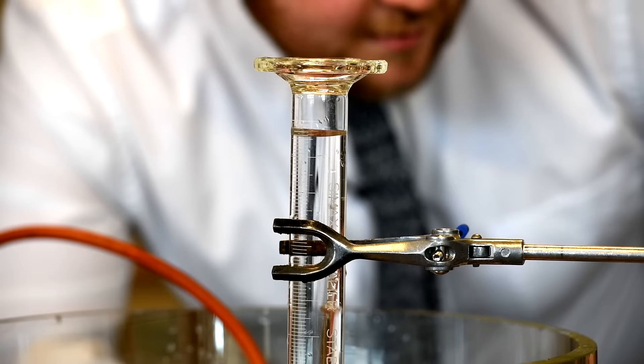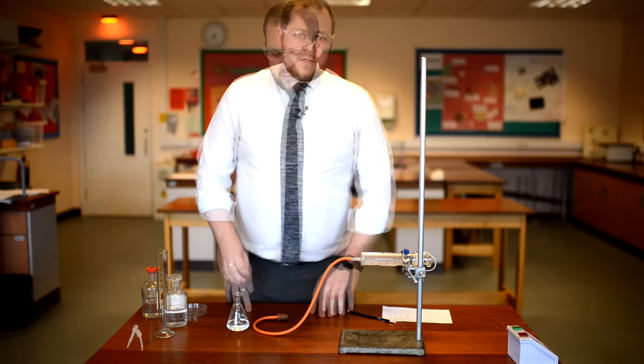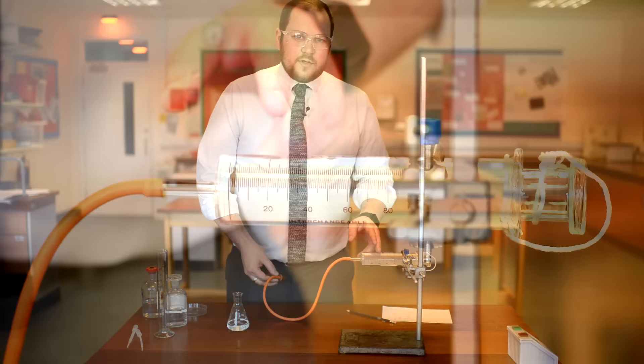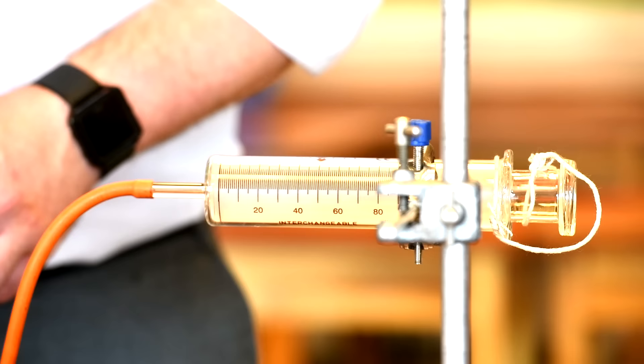An alternative method is to use a gas syringe. We're still using a conical flask, bung and delivery tube with the hydrochloric acid and magnesium. However, you're measuring how much gas fills up the gas syringe. Once again measuring the amount of gas produced every 10 seconds.